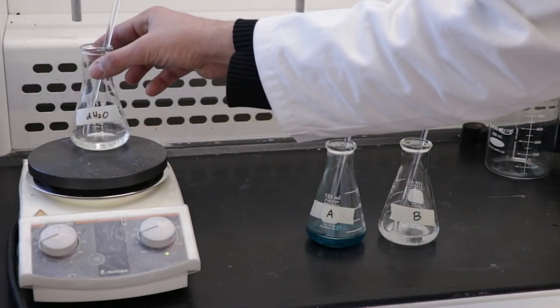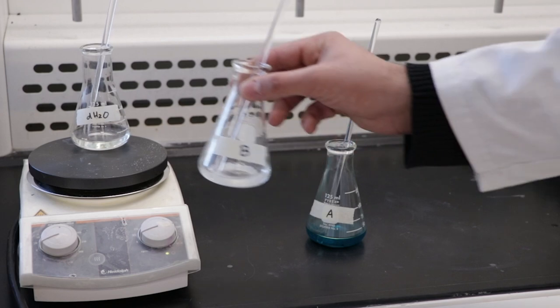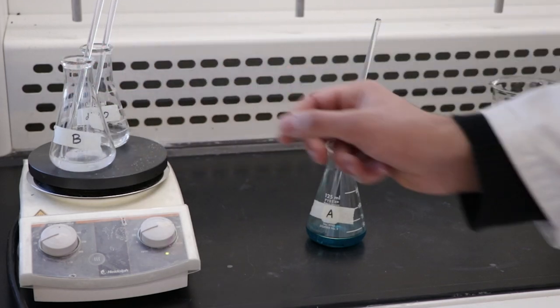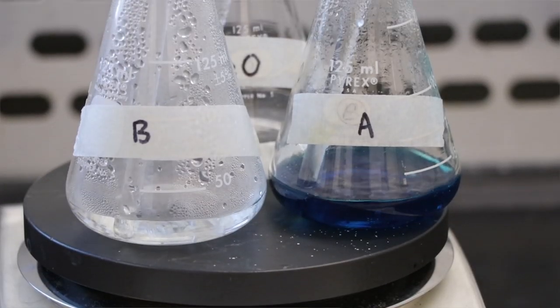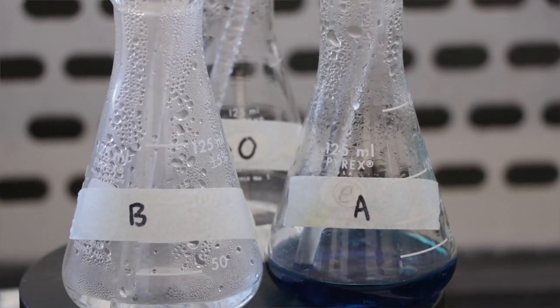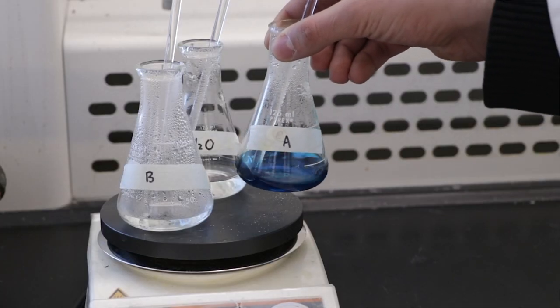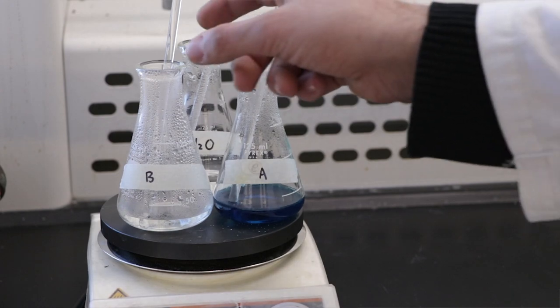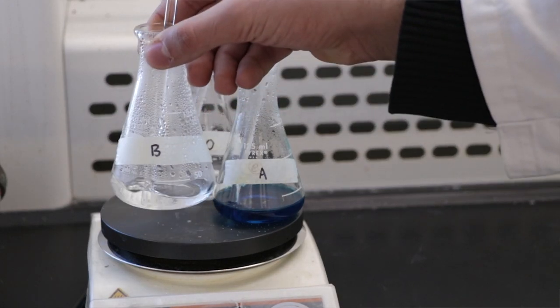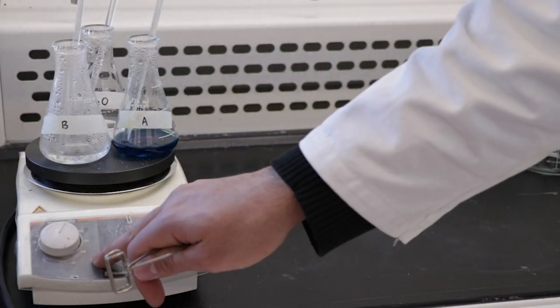Place all three flasks on a hot plate and begin heating the solutions. Bring the solutions to a gentle simmer. Stir the solutions in flasks A and B occasionally to ensure that all the solids dissolve.